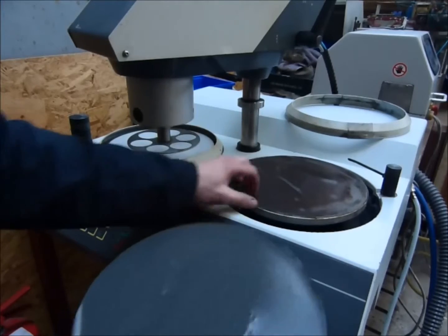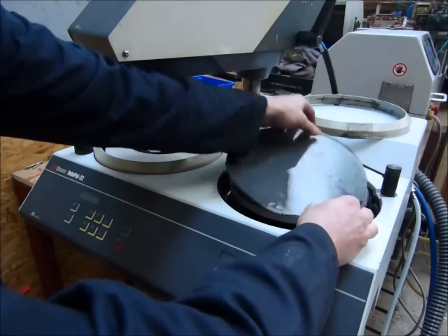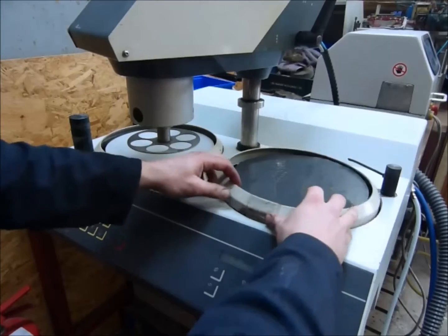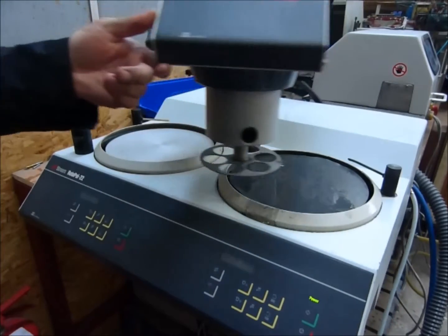The magnet's already on the platen. Place the paper on top. Bring your shield around, then bring the head into position.